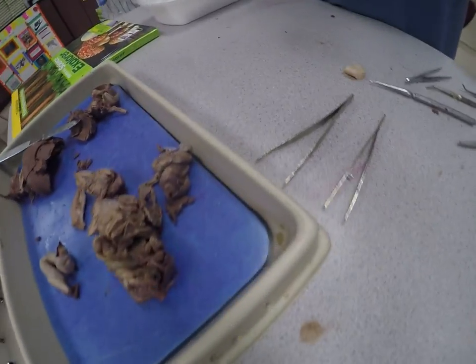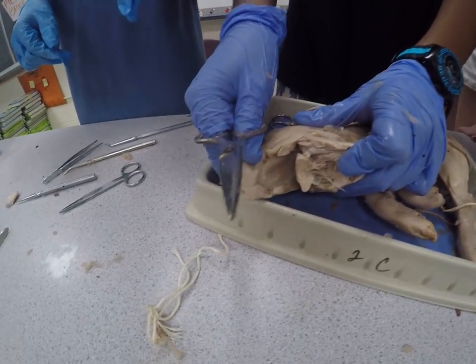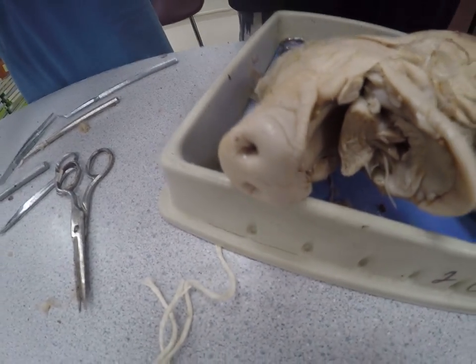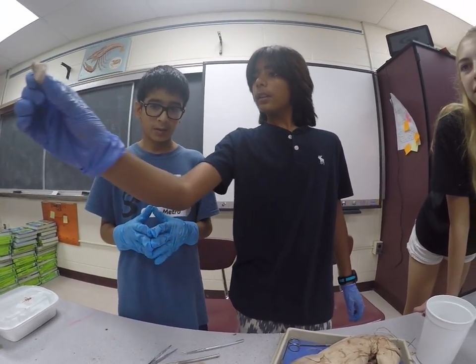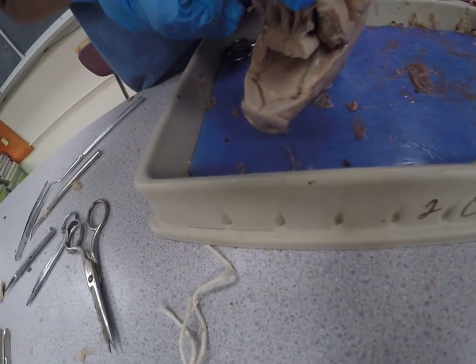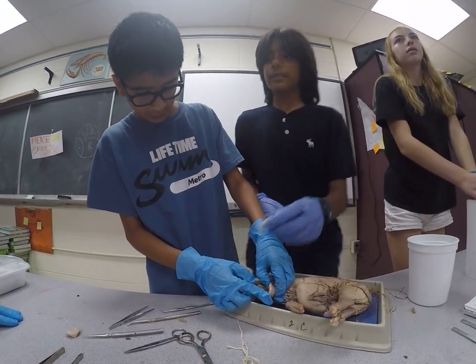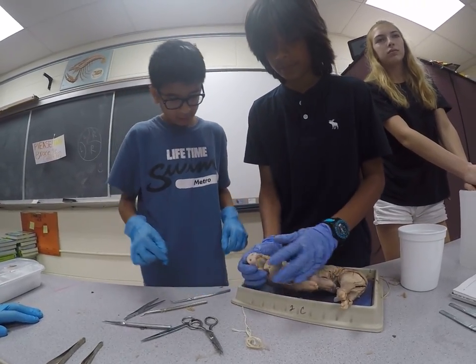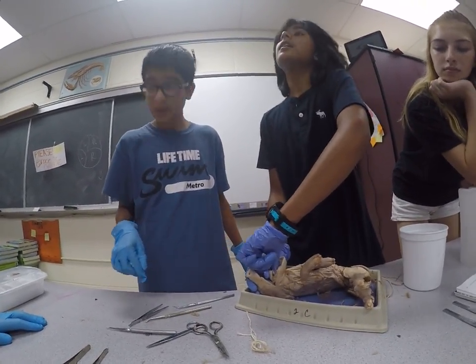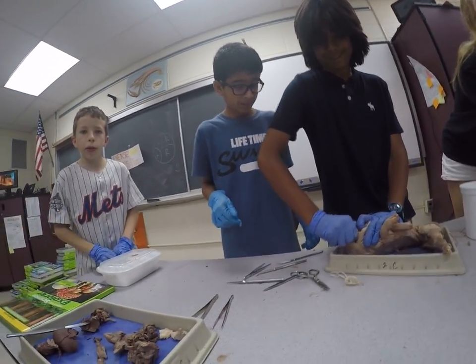We recently dissected a frog in class. I still have a frog tongue in a dish, so I'll get that from my locker and you can pass it around. We have found the other part of the pig's tongue. Inside the mouth, there are actually unusual ridges on the underside of the top jaw. The teeth are actually quite sharp, even though it's a fetal pig. If you want, you can pass the pig tongue around — and here is the tongue of a frog that I recently dissected in this class.